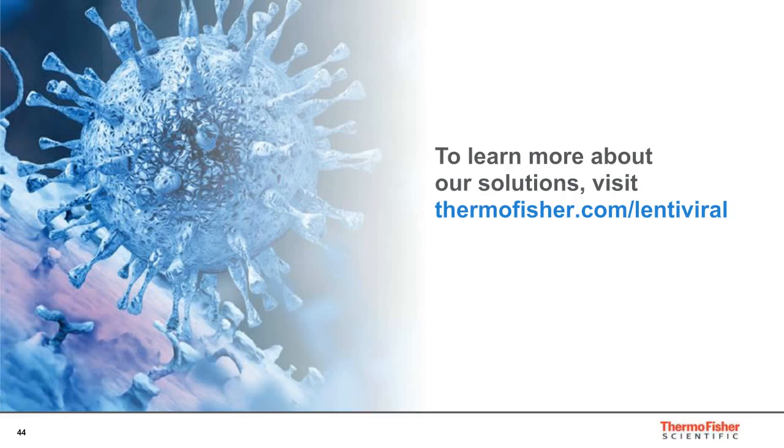And the first question is for you, Xavier. I'm currently using an adherent system for lentiviral production. When does it make sense to switch to suspension production?